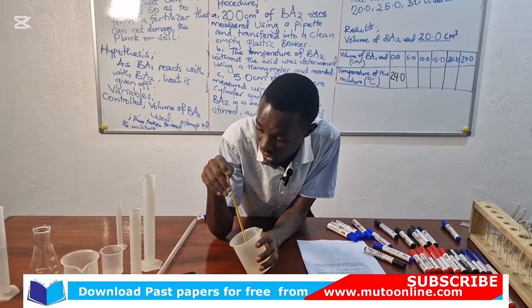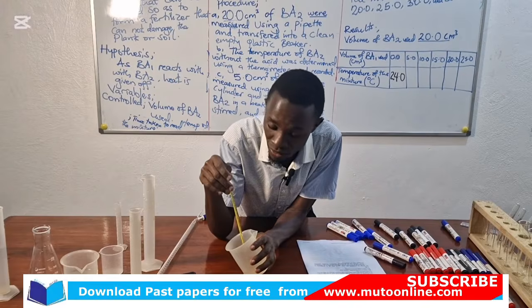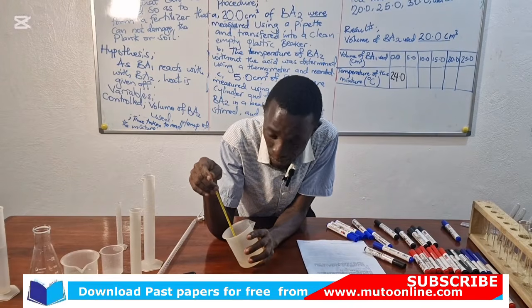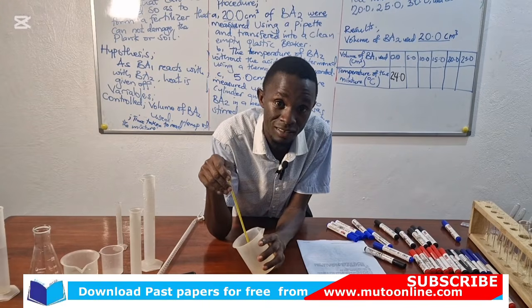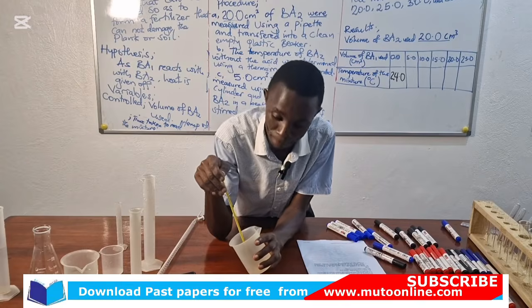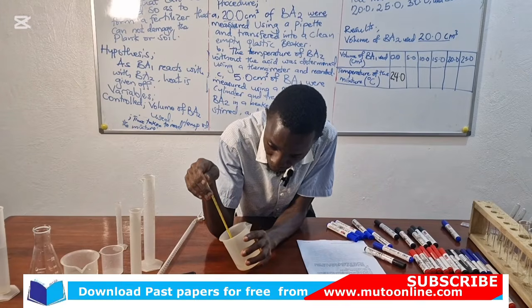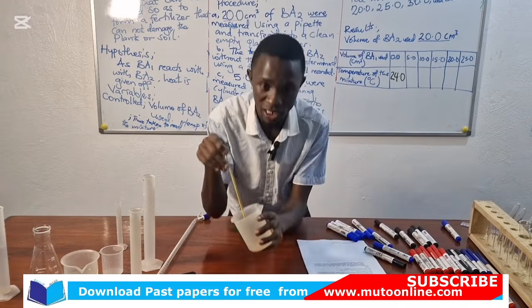You can use a stopwatch to make sure that the time taken to read the temperature is standard. It is fixed for all the values you're going to make, so that you do not make time an independent variable. So to me here, the thermometer reading is becoming stable at 28.